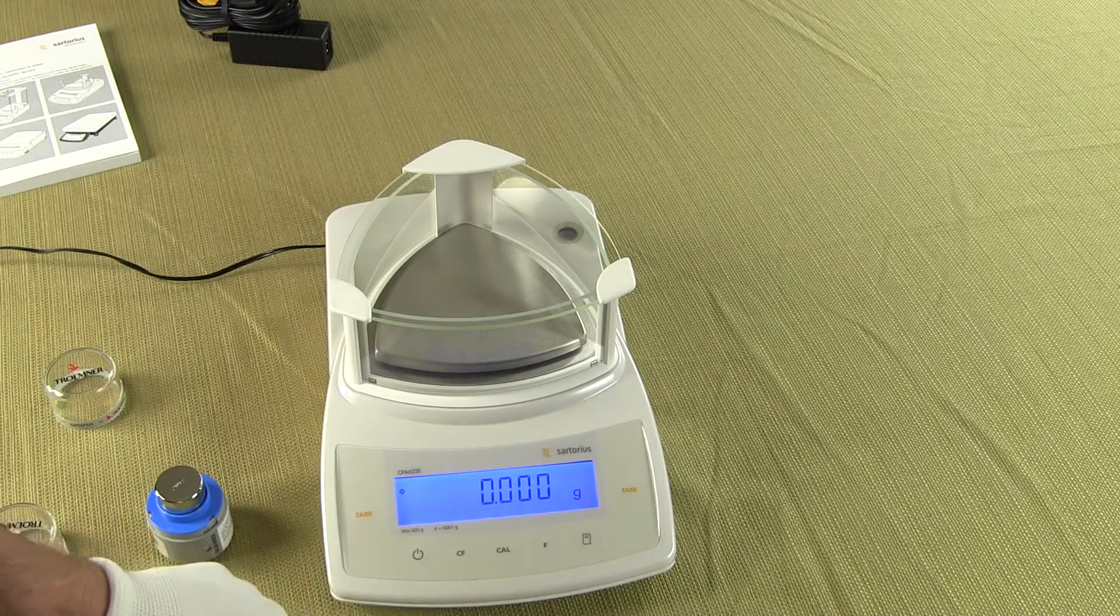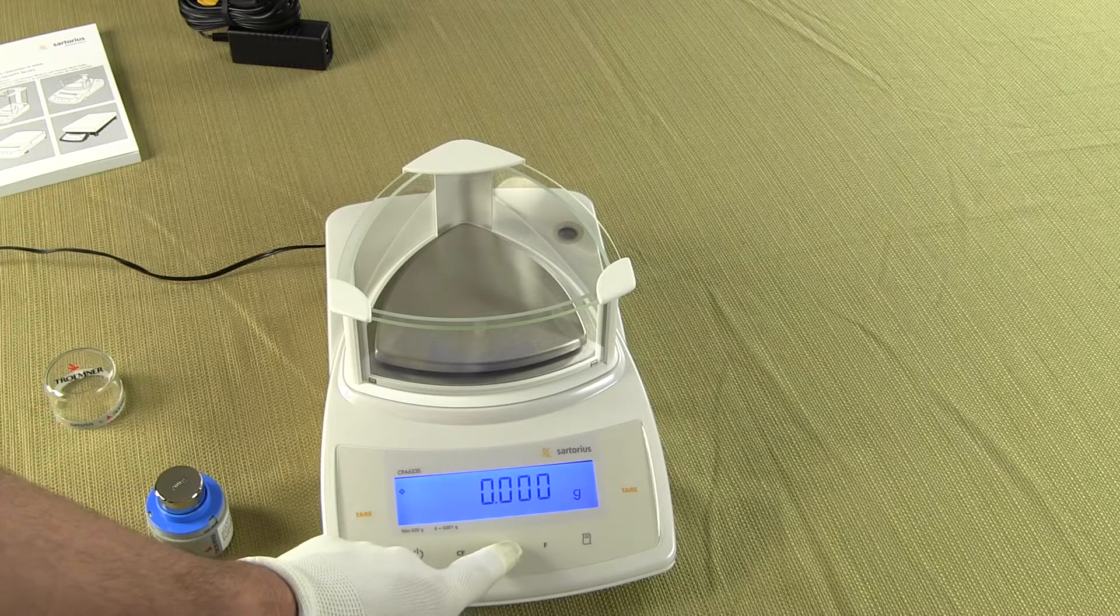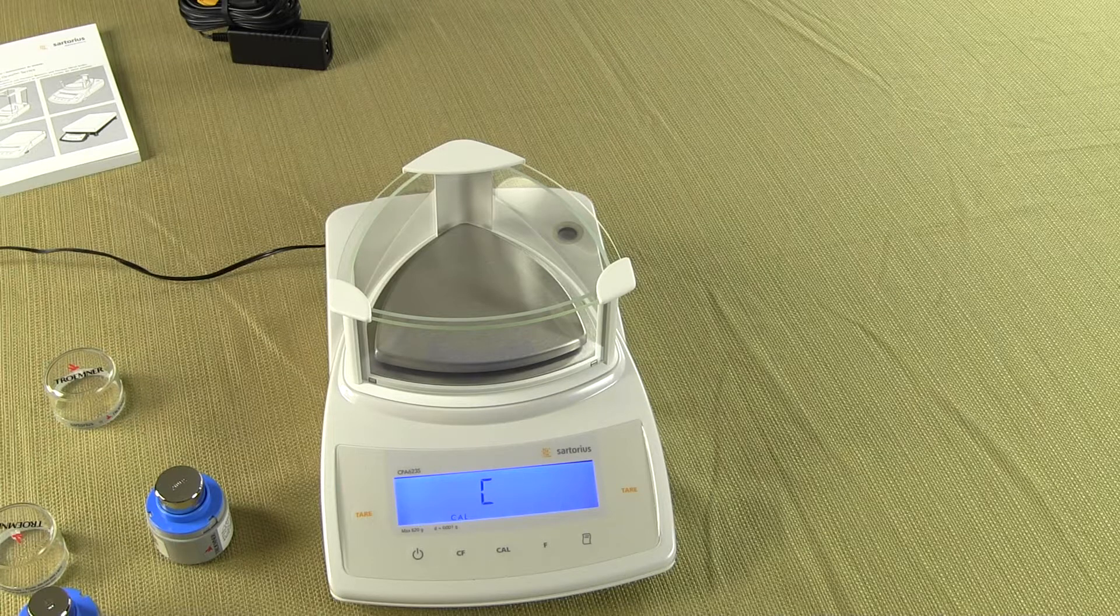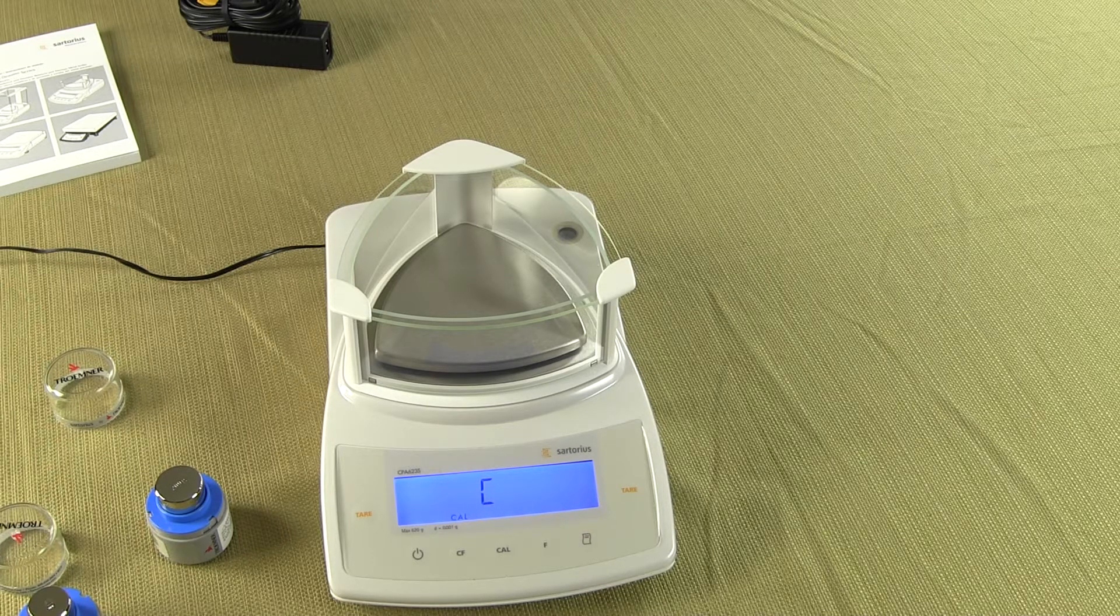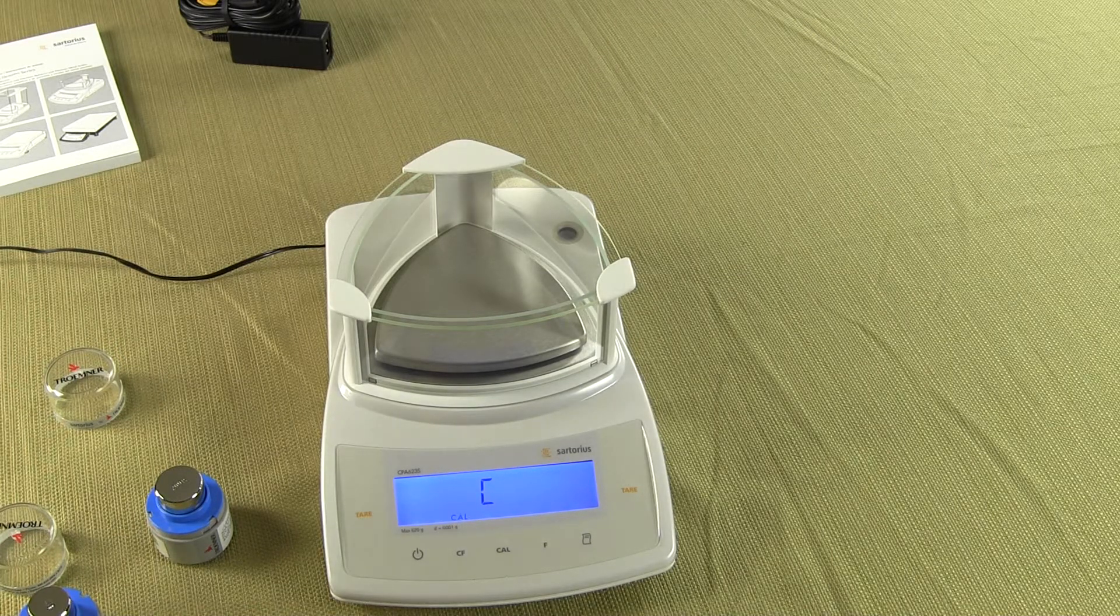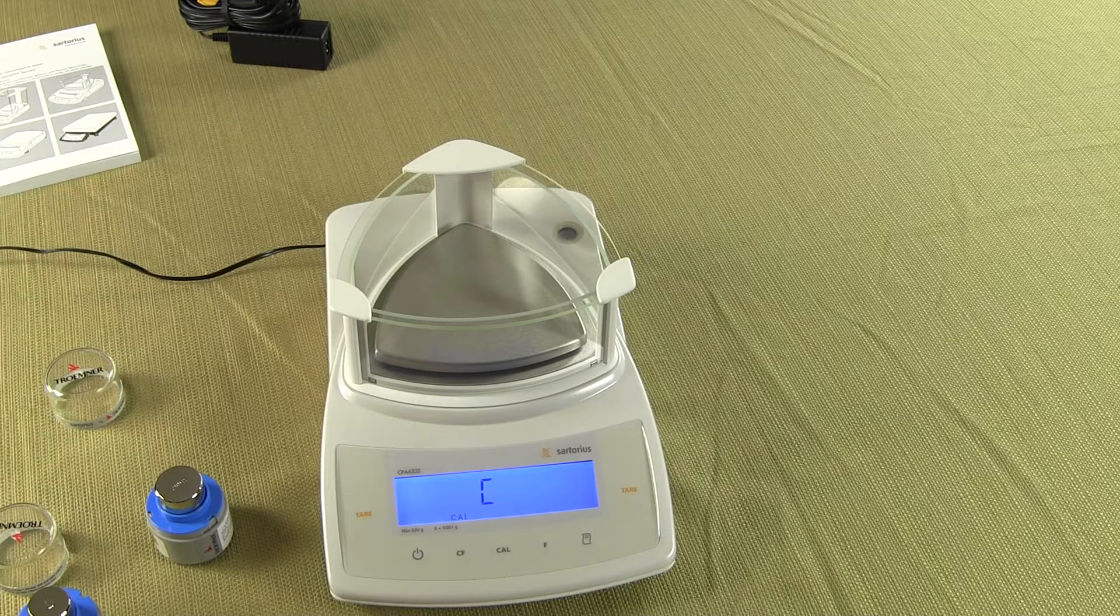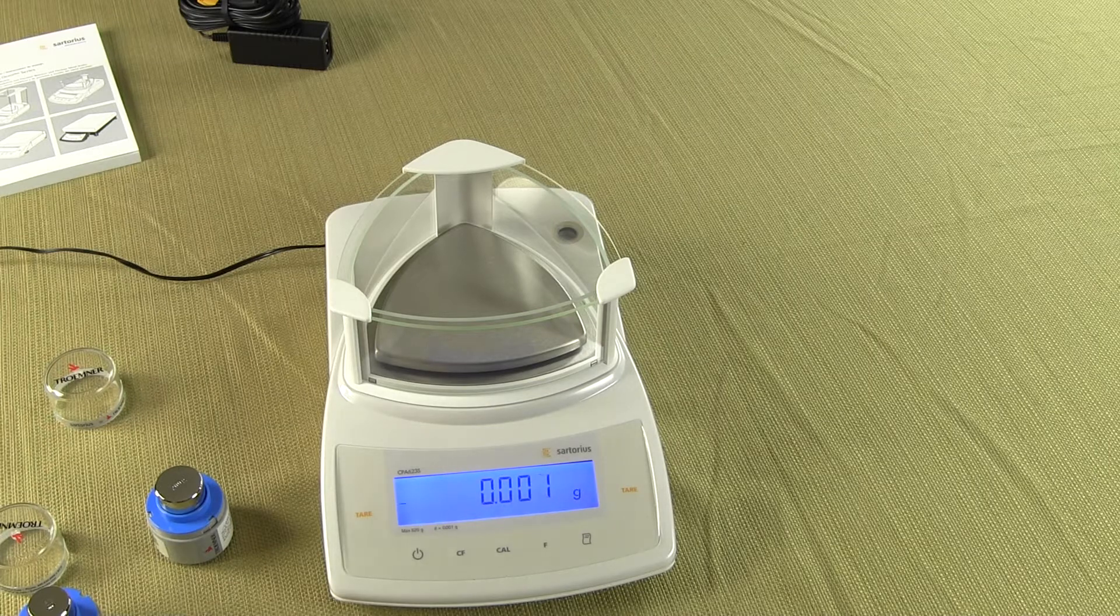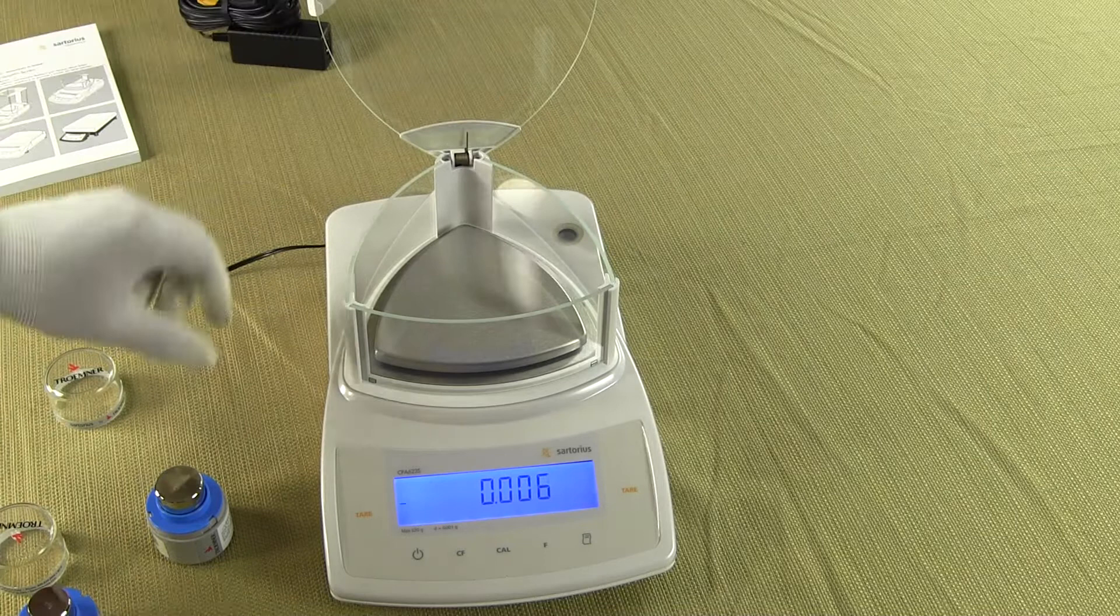So to do an internal calibration while the balance is running one simply presses the cal button and you'll hear the servo motor. And the balance has now completed its calibration and again I can put on my weights.